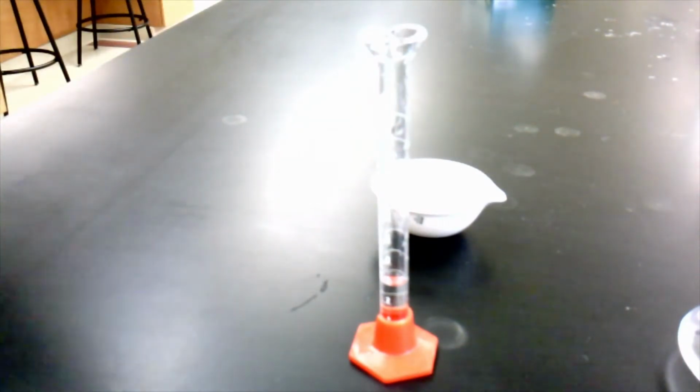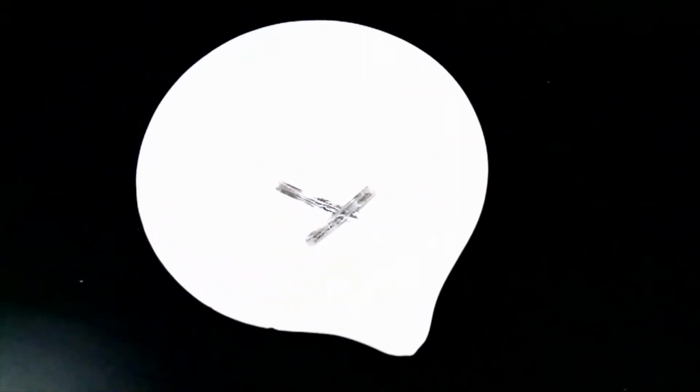Okay, so that looks like about 3 milliliters. Volume of HCl is not super important for this particular reaction. Now I'll try to get this to where you can see it without getting HCl on my webcam. We wouldn't want that, now would we? Okay, hopefully we can kind of see what's going on here.